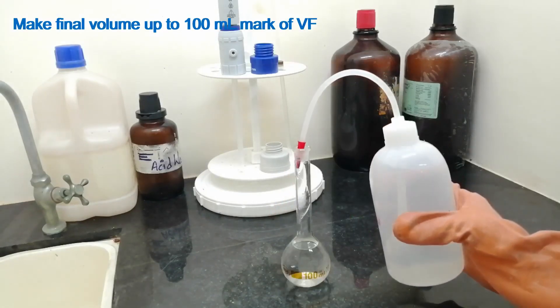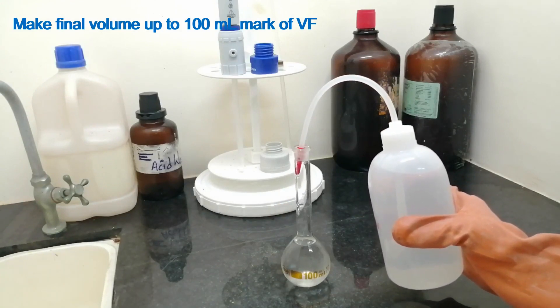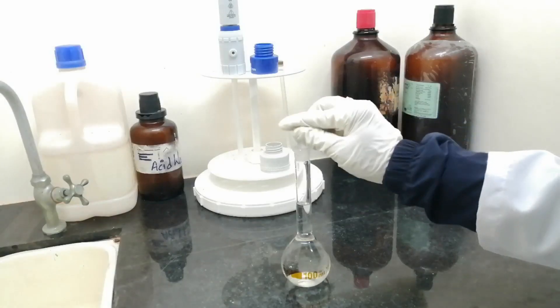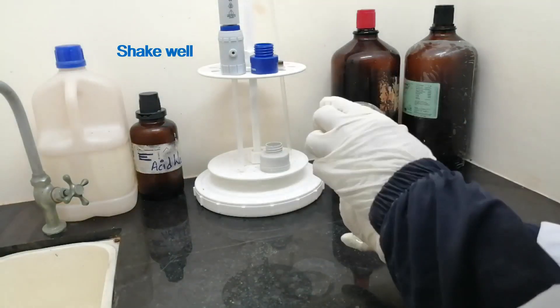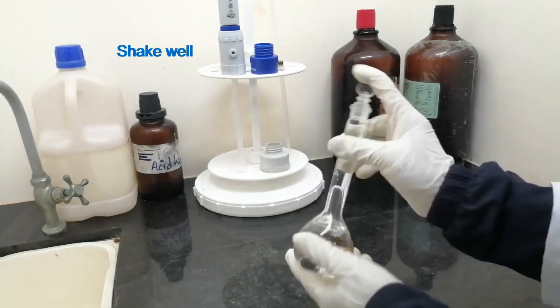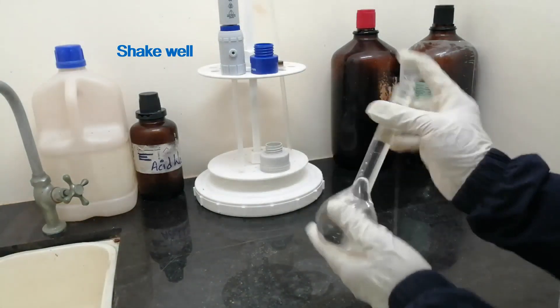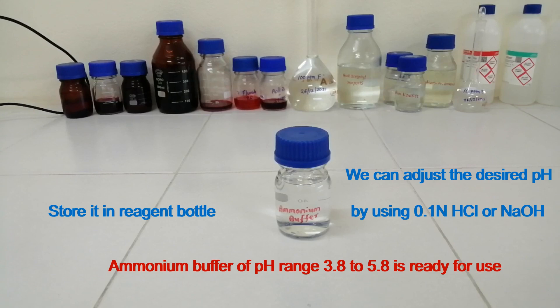Make the final volume up to the 100 ml mark of the volumetric flask. Shake well. Store it in a reagent bottle. Ammonium buffer of pH range 3.8 to 5.8 is ready for use.